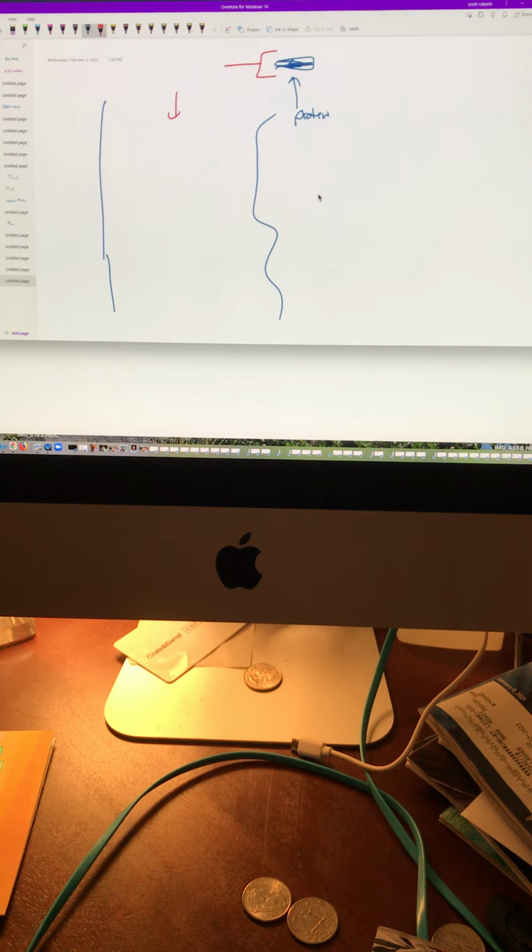Instead of the column being beads, there are more antibodies. So this thing can capture the antibody bound to this. You understand? This antibody, what I didn't tell you, was labeled with a color, so you can zap it with a laser. Got it? Well, it's not an antibody necessarily to the antibody, but it's an antibody to the antibody bound complex.